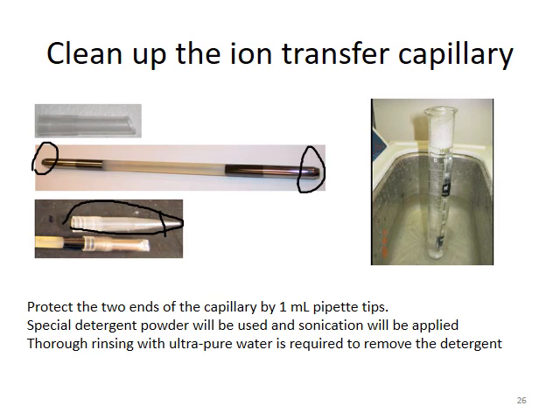After the cleanup by the detergent, you must rinse the capillary with ultra pure water. Any residue of the detergent will severely affect the performance of your instrument, so the thorough rinsing with ultra pure water is very, very crucial.